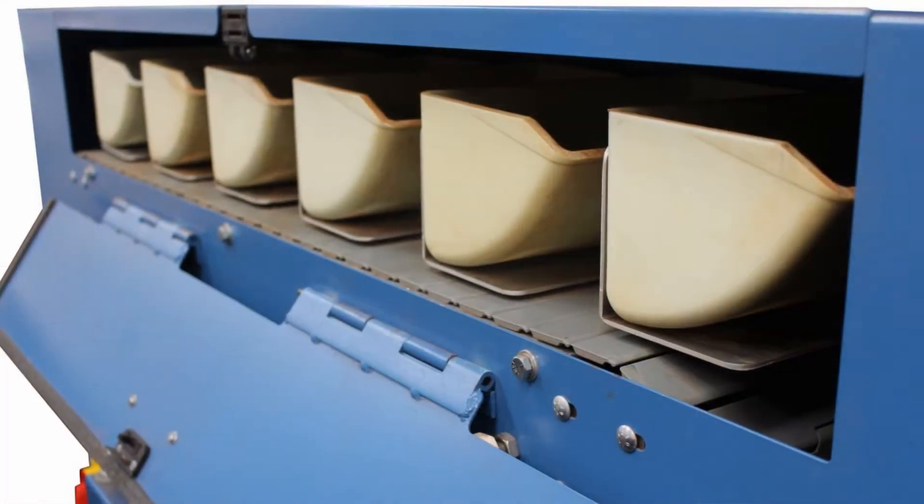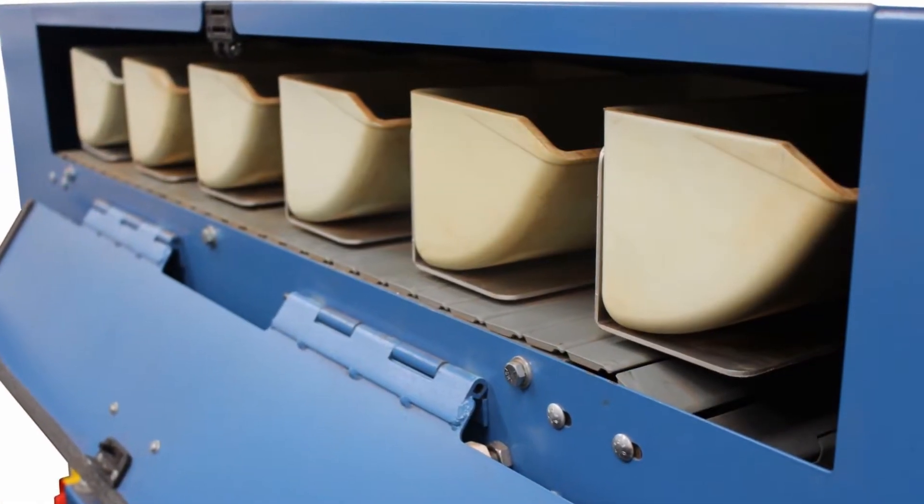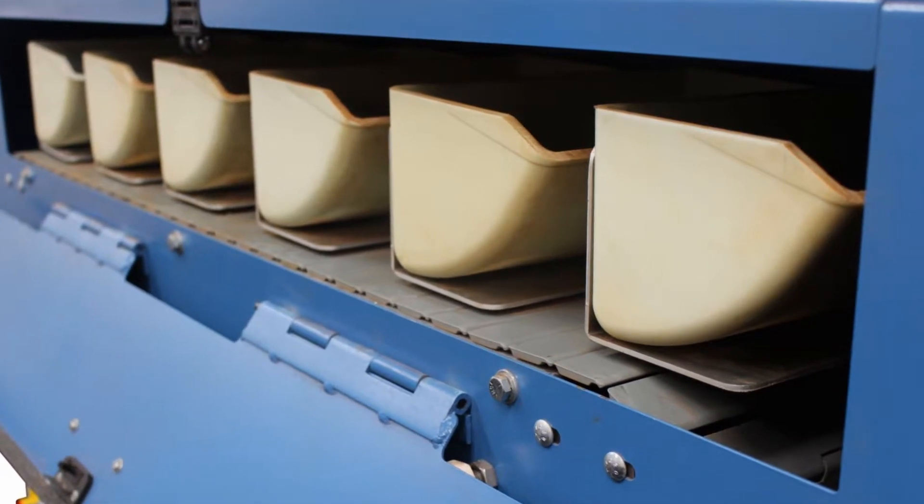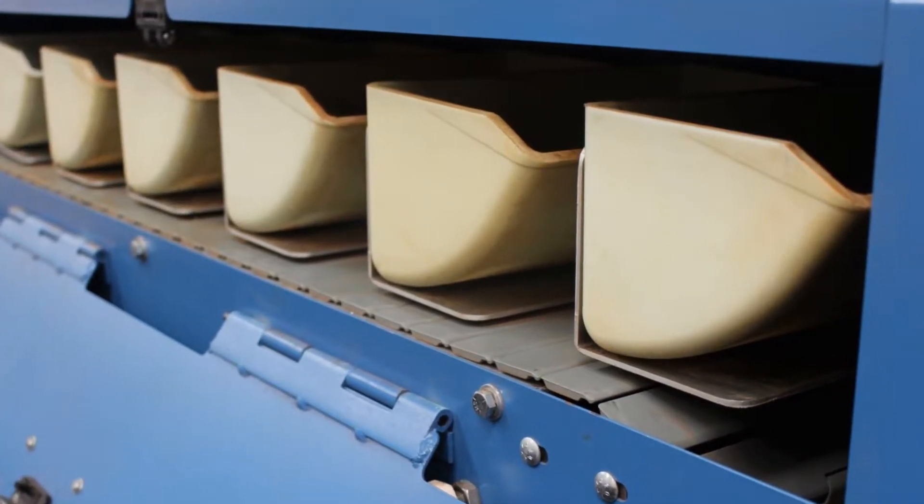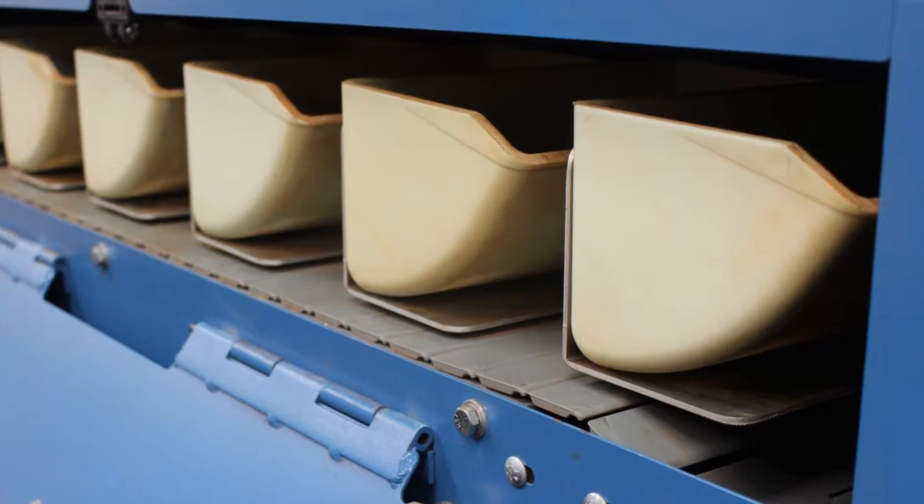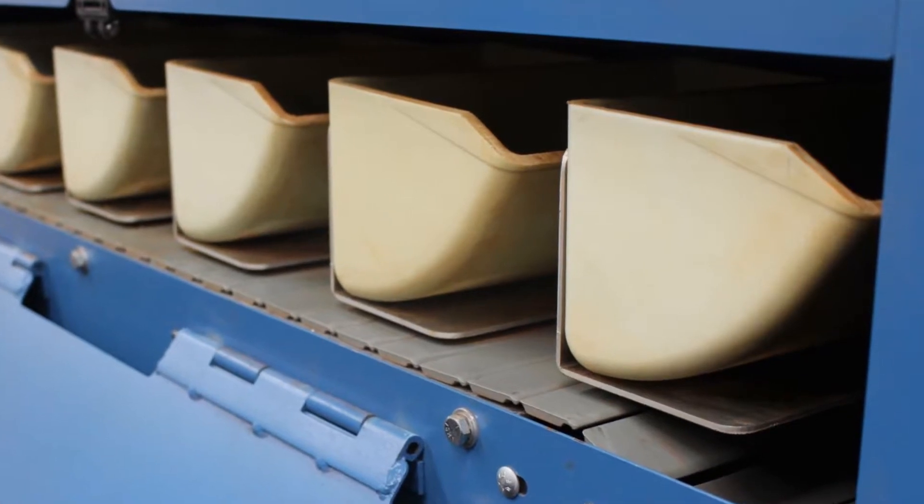Up to 6 samples can be loaded into the SieveMaster 300's automatic feeder which processes each sample one after the other without the need of outside input.